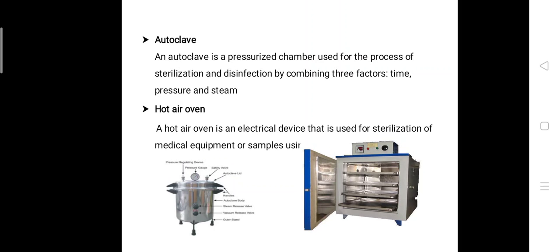And also these autoclaves are mostly used for the sterilization of medical laboratory equipment, and they are commonly used for preparing the culture media, which is used for growing the microorganism. Next we have here is the hot air oven.